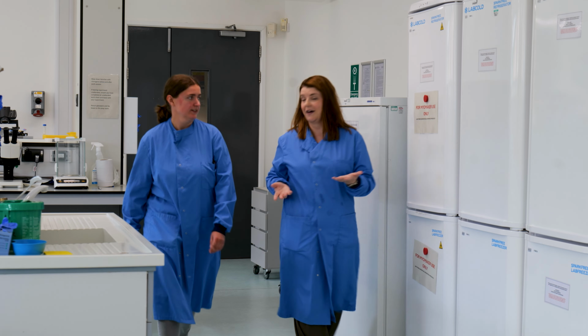So what we're currently trying to do is build a 3D model of the obesogenic breast cancer microenvironment, and we're incorporating fat cells from two different sources. So we have fat cells from visceral fat, which is your bad fat that you have around the belly, and then we have fat cells from subcutaneous fat, which is your good fat, if you like, that burns energy. And what we want to look at is whether exercise has a differential effect on the cancer cells, whether they are incubated with either the visceral fat or the subcutaneous fat.